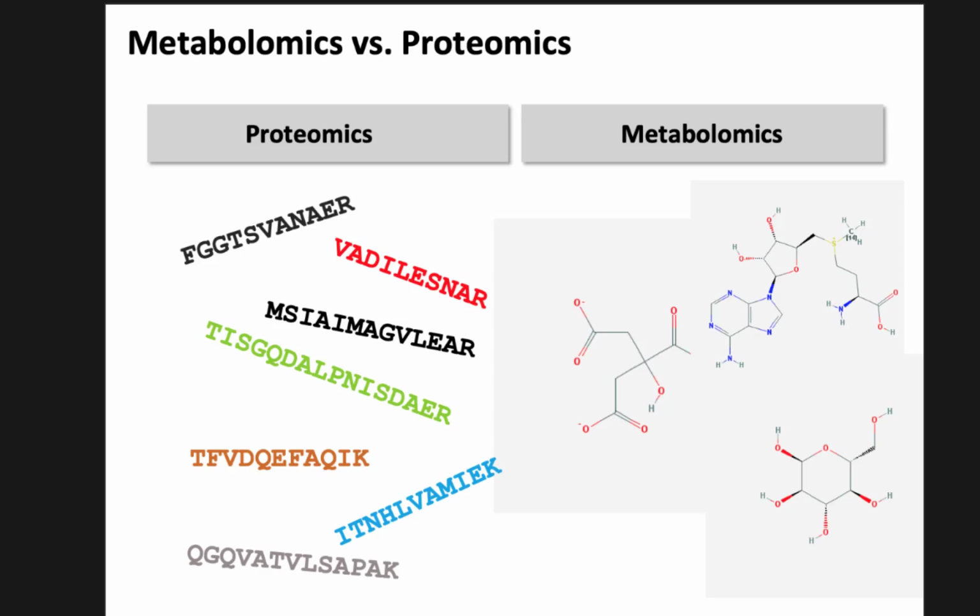So when we look at metabolites, they tend to have very diverse structures. In proteomics, things are easy. They're linear. We have 20 amino acids. And these are just some selected metabolite structures. And you can see that there's a large diversity. We also have different elements that are popping up that are not so frequent in, or not present in peptides. That's all like halogens.